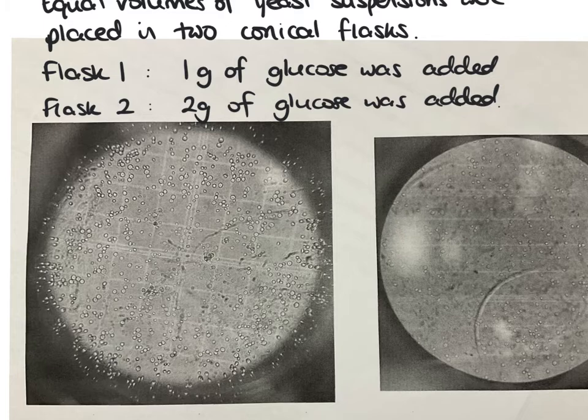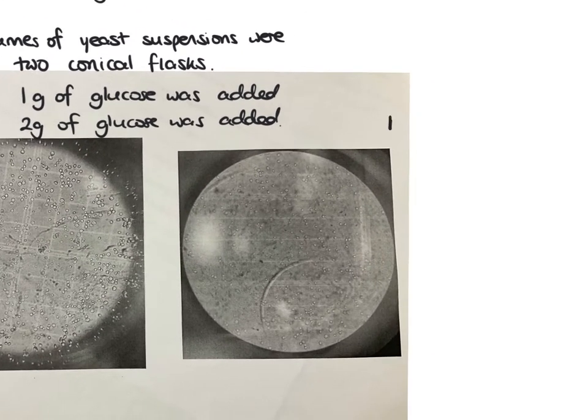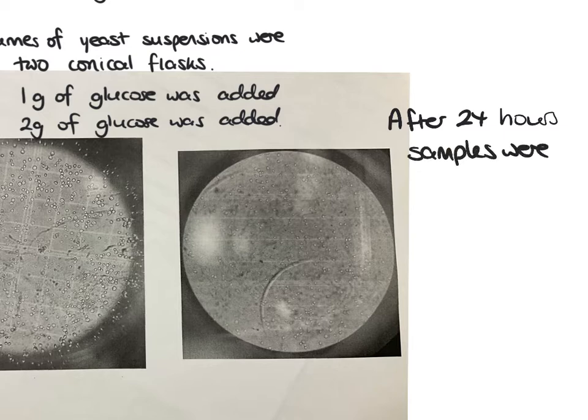And then I've run out of space here. You're just writing on file paper, so you can say after 24 hours, samples were taken from each flask.